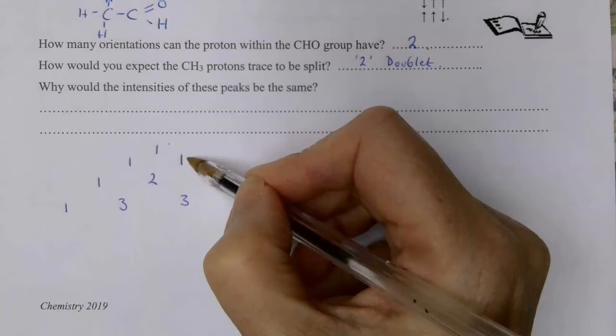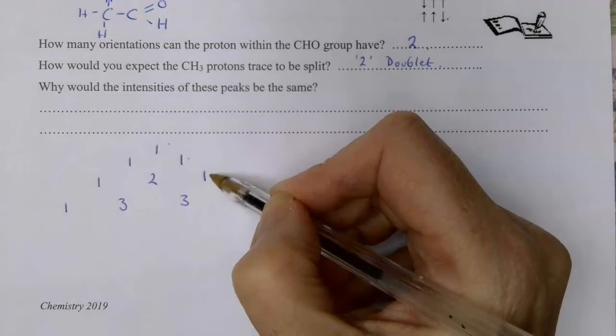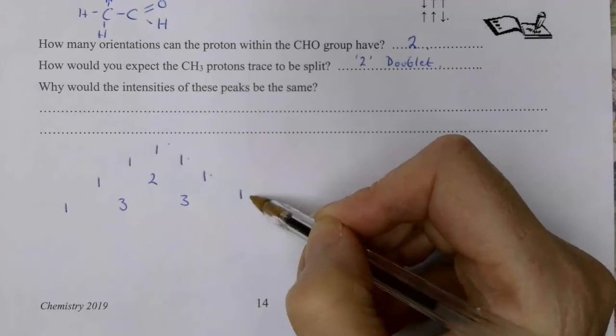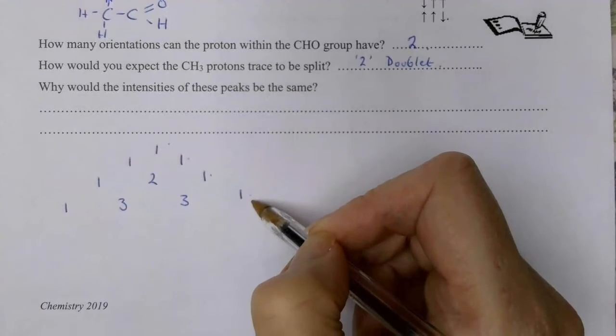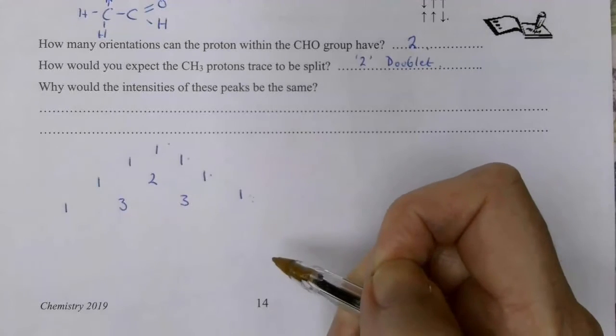If we've got a doublet, we're going to get 2 lines of equal heights. If we've got a triplet, we're going to get lines in the ratio 1 to 2 to 1. And if we've got a quartet, we're going to get a splitting pattern that goes 1 to 3 to 3 to 1. Now you don't need to worry about that. It's not something that you're expected to know, but it's a useful tool for working out intensities.